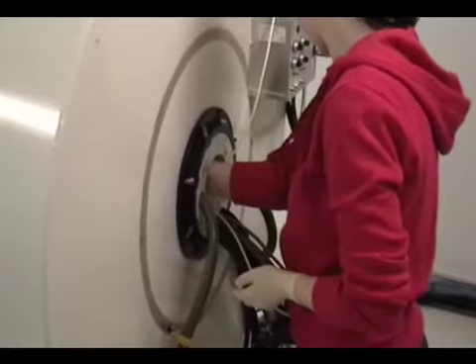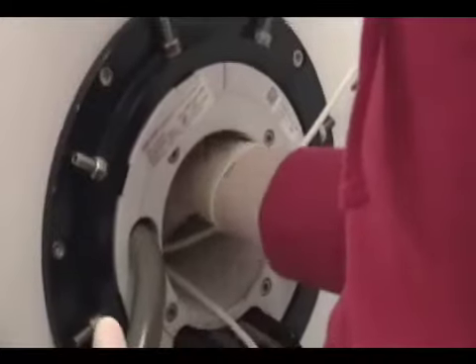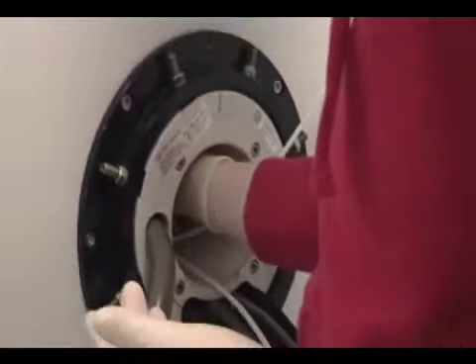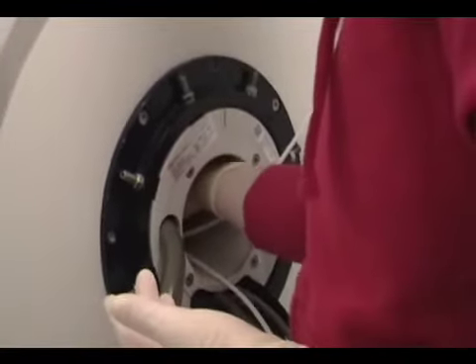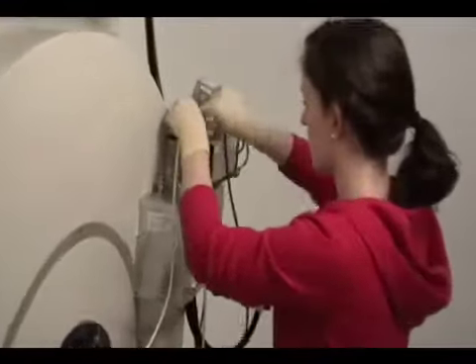Here we can see the researcher tuning and matching the quad coil. Each knob on the end of each rod contains a clutch, so that over-rotation of the rod does not damage the coil. After the coil has been perfectly tuned and matched, the cords are connected to the combiner that connect to the system.